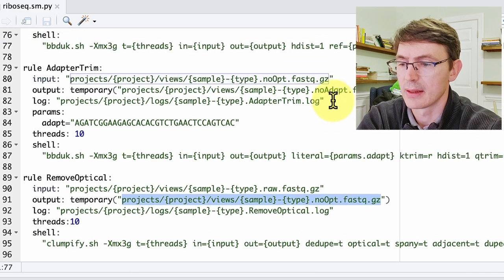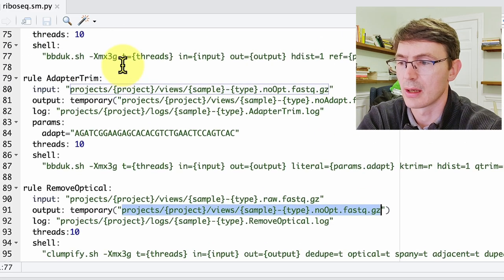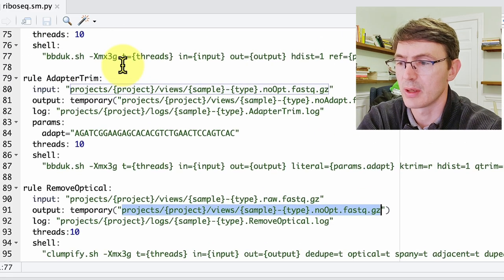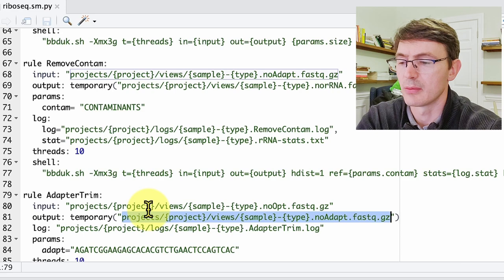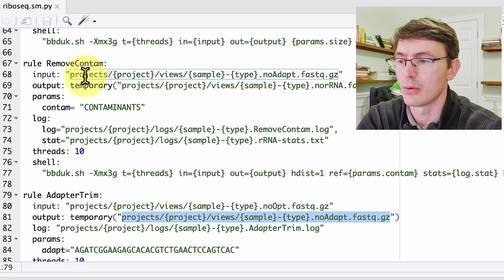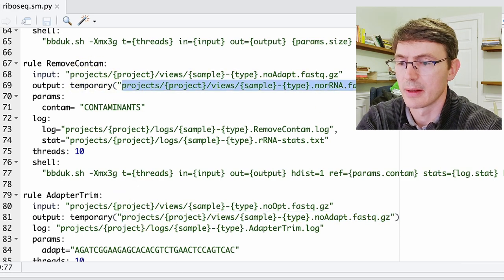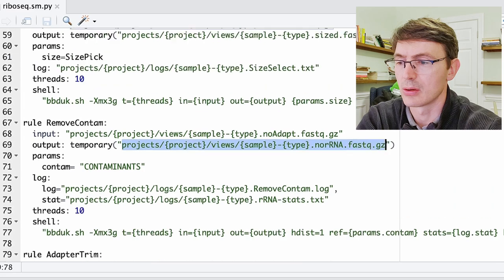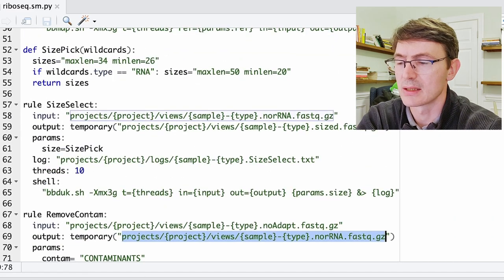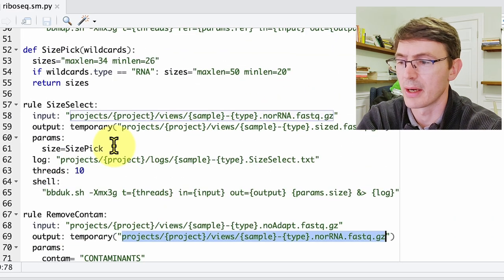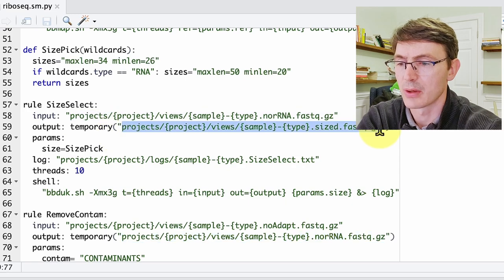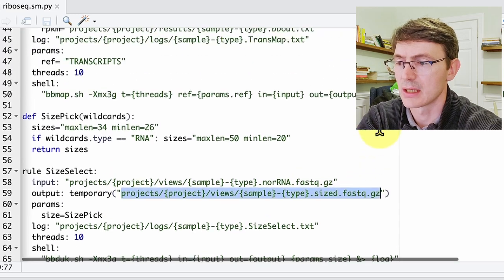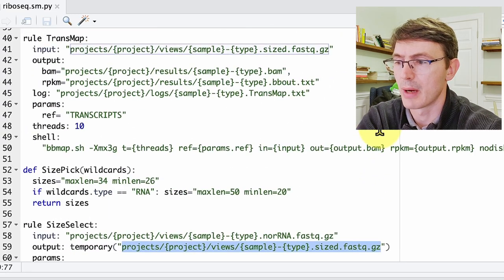Then we do this remove optical that is just removing some artifact from Illumina sequencing reads. Then these results are fed into the adapter trimming. So these adapter-trimmed reads are then removed of ribosomal contaminants. And then we take those reads, we do a size selection, and this will depend on whether they are the RNA or the RFPs.